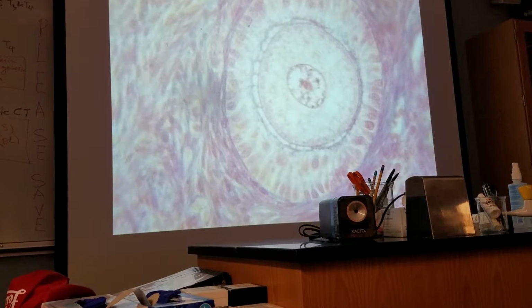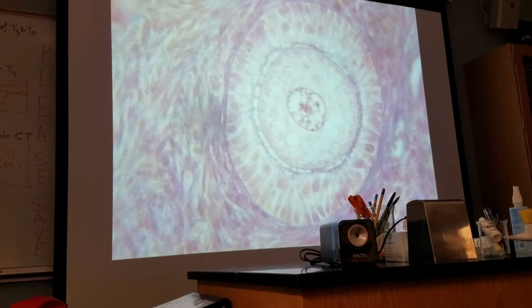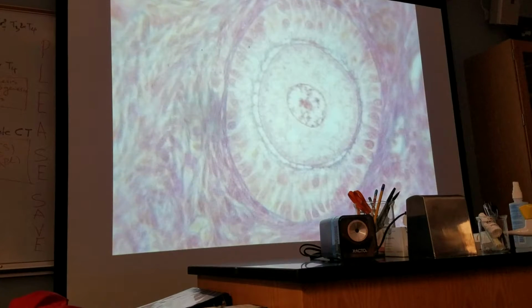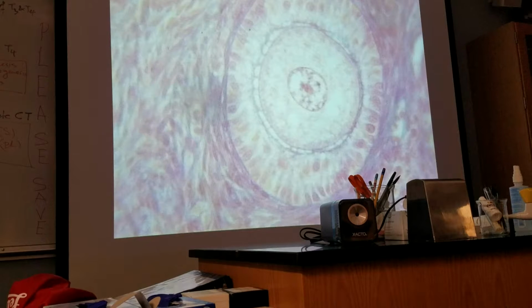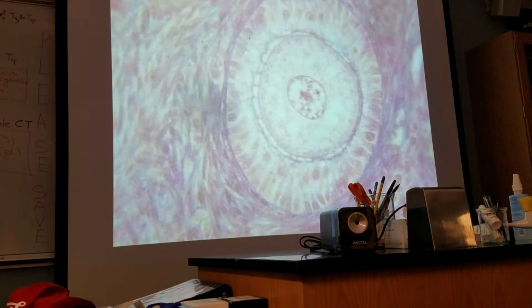Beautiful. So what follicle is this? It's a primary follicle. Okay? I will take you now to the secondary follicle.